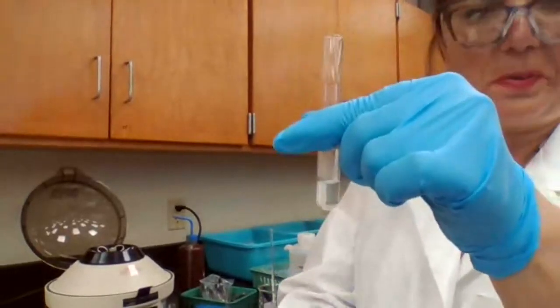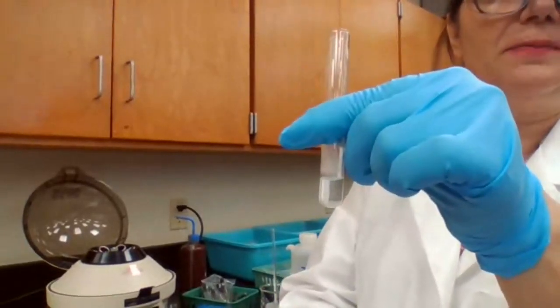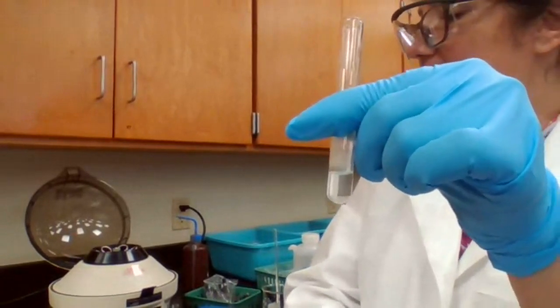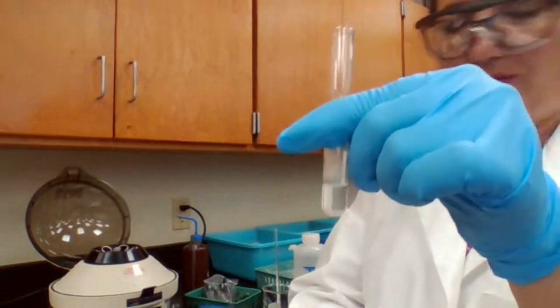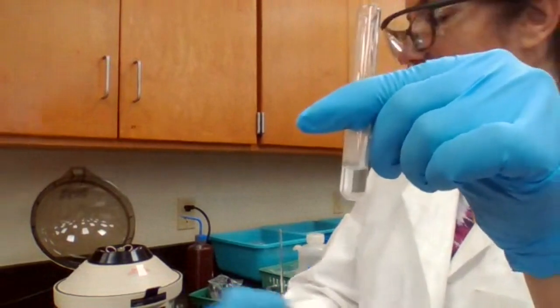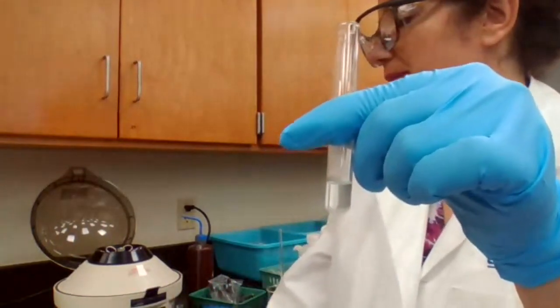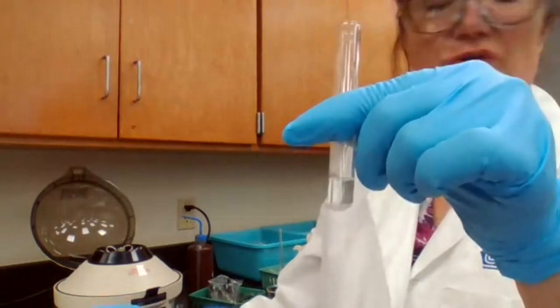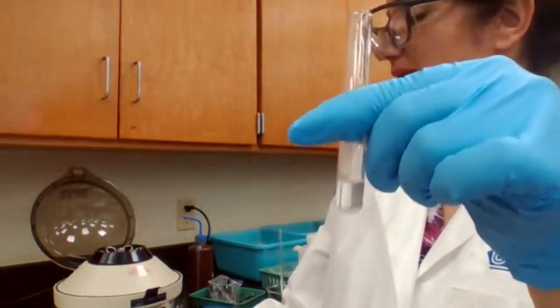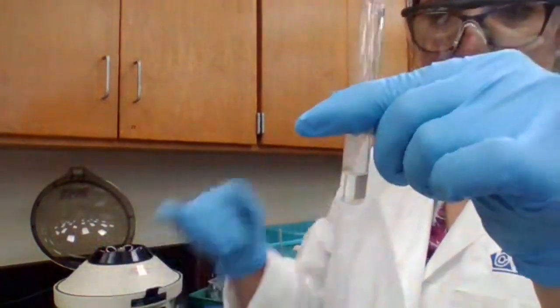I'm going to report which part of the procedure I'm dealing with now, because it's important, and that is part 1C, confirmation of lead 2+. To confirm the lead 2+, we have to add the chromate ion. Based on the procedure, we are going to add 2 drops of acetic acid, and then we add 5 drops of potassium chromate following the procedure. So 2 drops of acetic acid and 5 drops of potassium chromate.